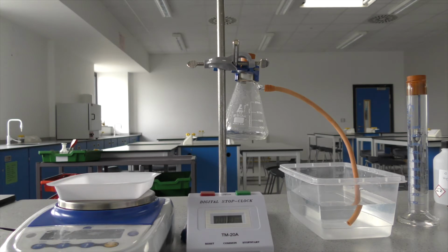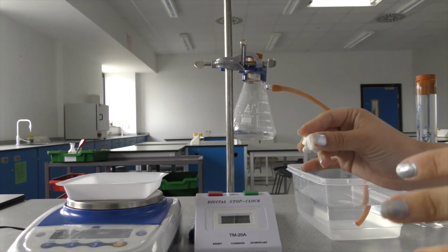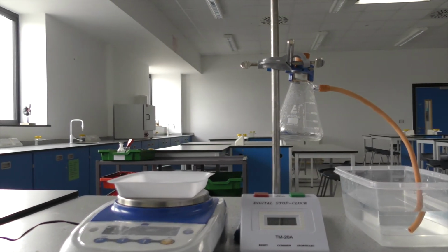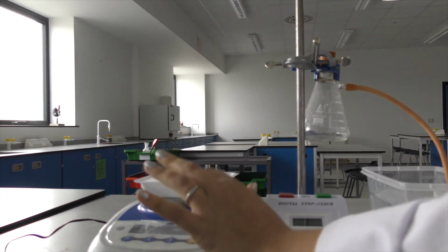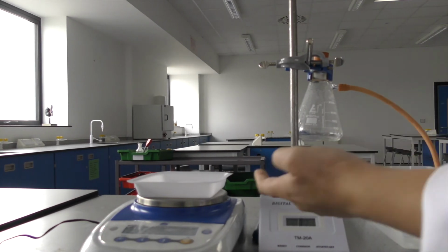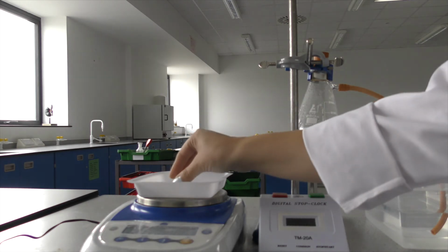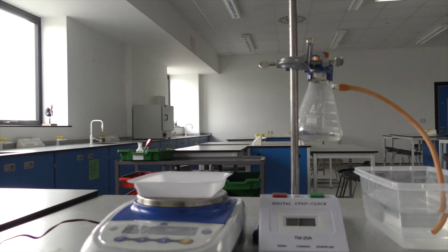We're going to start with our large marble chips, and we're going to weigh them, to make sure that we use the same mass each time so that it doesn't affect our results. The first thing you need to do is zero your mass balance so you don't include the mass of your plastic cup or whatever you're measuring it in. And we measure the mass, and we want them all to be roughly the same.